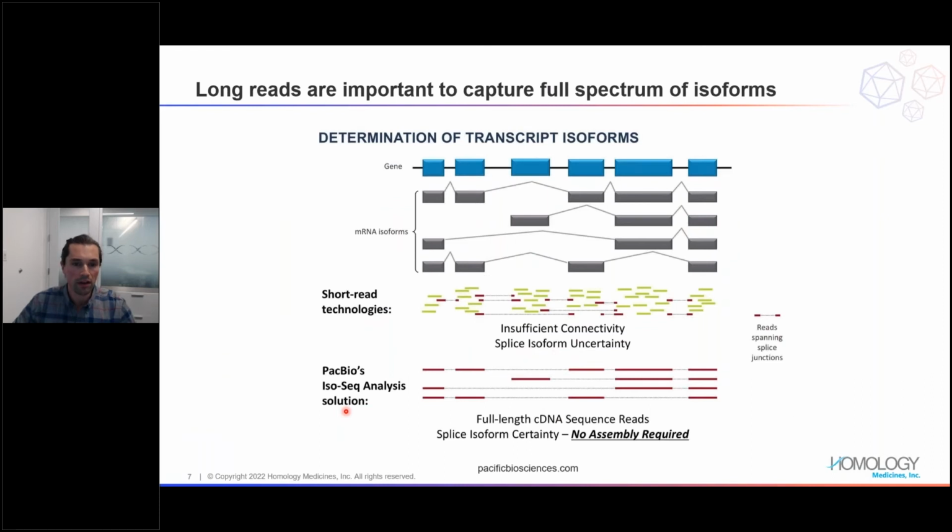This is made more apparent on this slide that I got from PacBio, actually. You have your gene up here, in blue, represented by these 6 exons. You're going to have potentially several different mRNA isoforms. You have some exon skipping here, and some here and here for this isoform. So you have these 4 different isoforms coming from this one gene, right? If you're looking at, say, just this read with short read technology, you don't know if it came from this mRNA isoform or this mRNA isoform. This is really important to us. This is central for safety and efficacy for our patients.